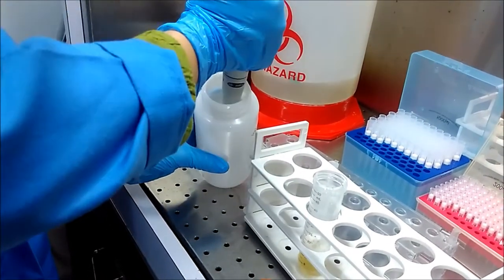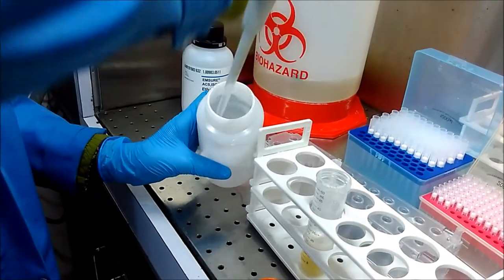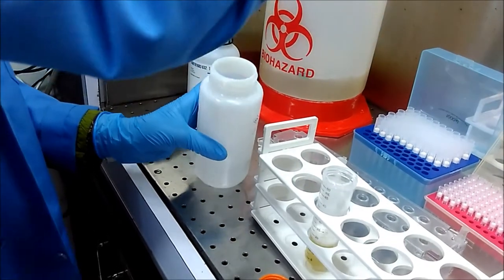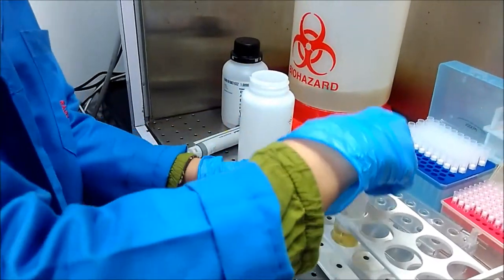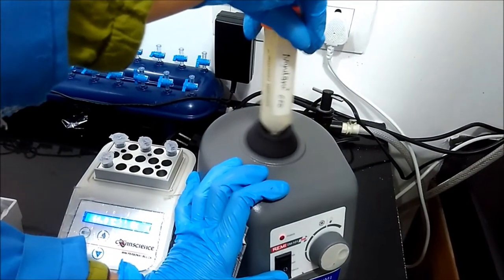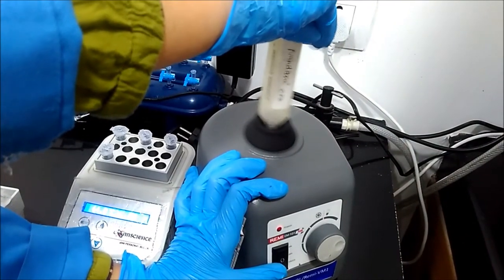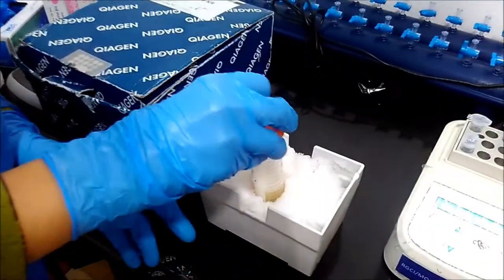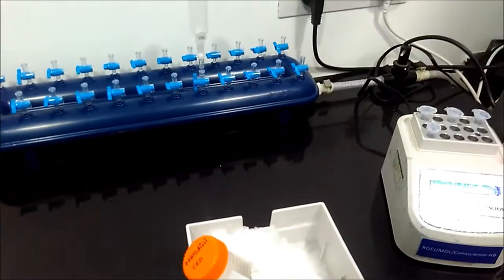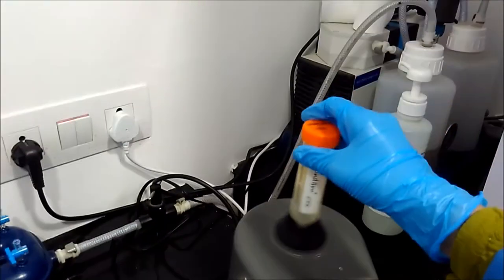ACB buffer basically contains isopropanol, which precipitates all the nucleic acid and makes it aggregate, as nucleic acids are insoluble in isopropanol. We can use ethanol instead of isopropanol, but in the case of large sample volumes, we use isopropanol. After vortexing, we keep our lysate on ice for 5 to 10 minutes.